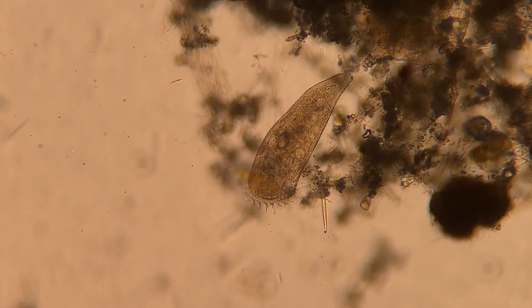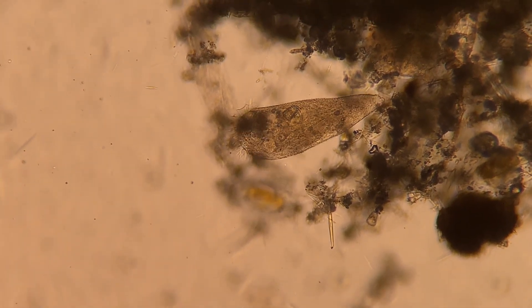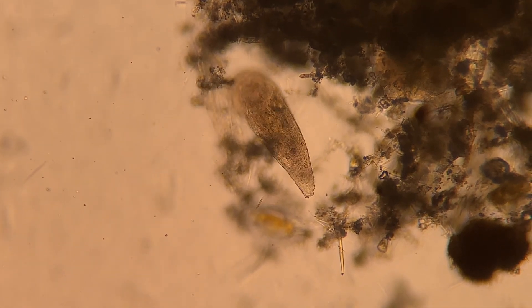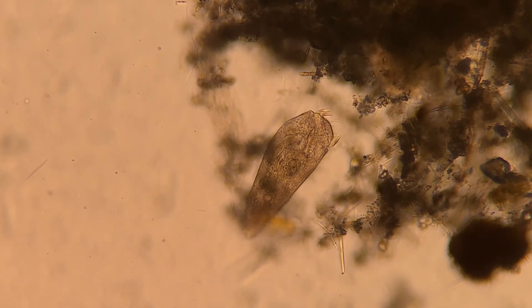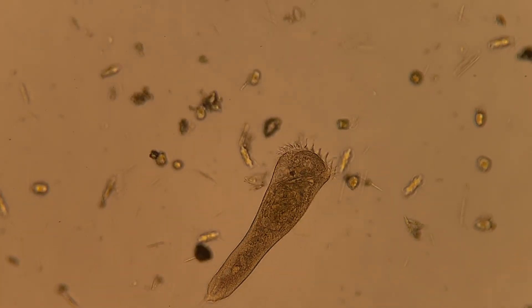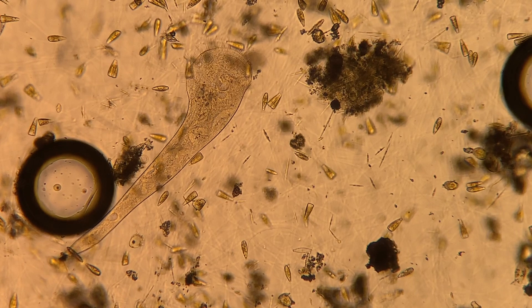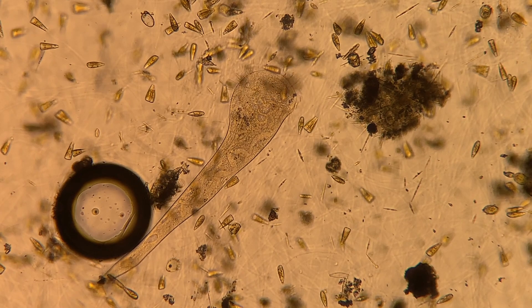Here I found a species of stentor — I have never caught stentor before, so that's kind of exciting. Normally in YouTube videos I see a lot of these guys that are really bright blue, so I had to double check just to make sure this was in fact a stentor. These guys do come in brown varieties as well as yellow and red. Here's a couple of them swimming around. You can tell they are stentors because they have a really long, kind of trumpet-like shape.